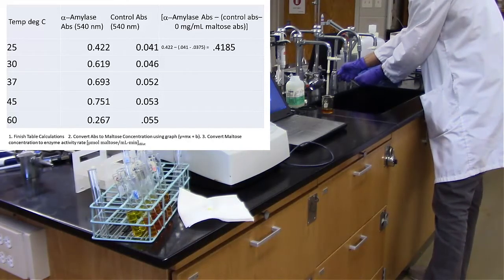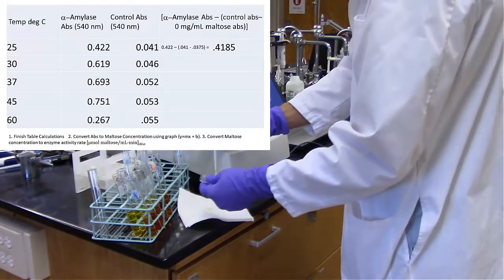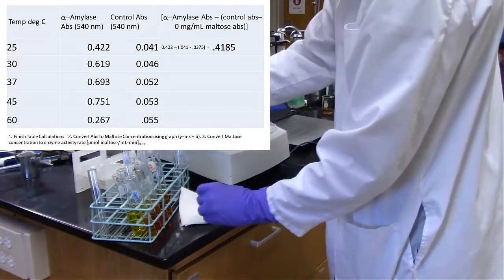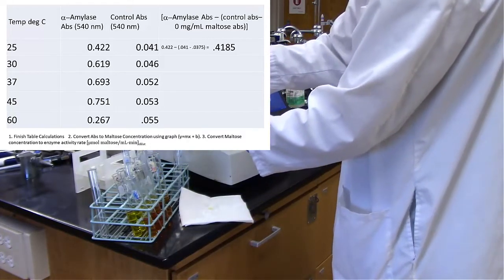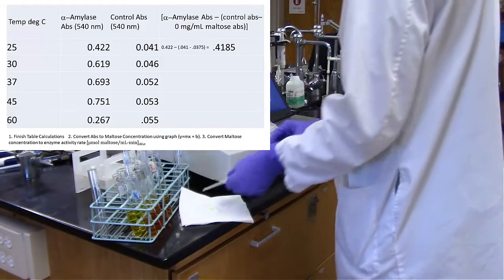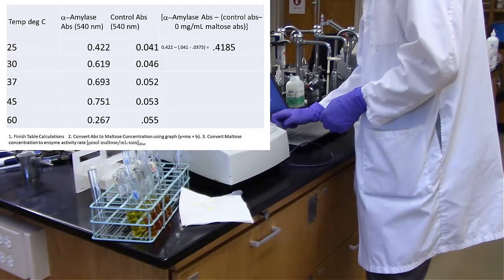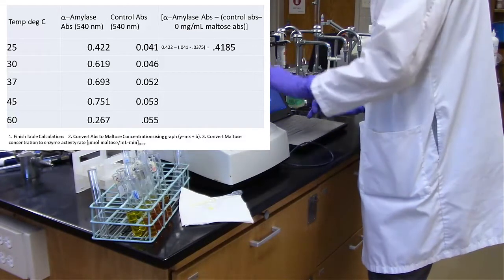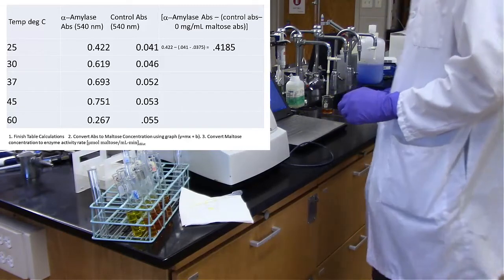So that's actually slightly surprising. So I would have expected, again, 37 degrees for sure to be the highest. It definitely was higher than 30 degrees, definitely higher than 25. But 45 degrees actually seemed to be the optimal temperature based on the numbers that we looked at. So it's hard to say if a little bit more or a little bit less than 45 was optimal. Based on the sharp drop-off at 60, I'm going to guess a little bit less than 45 was probably optimal.